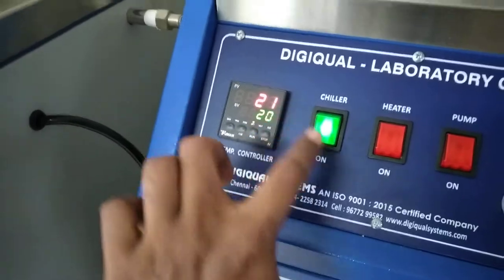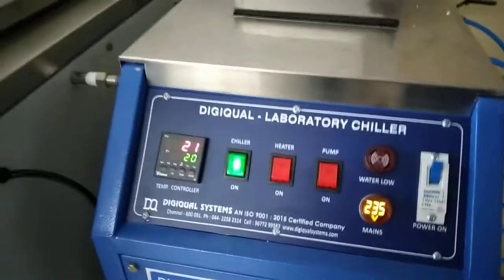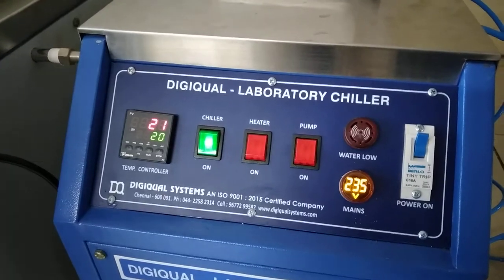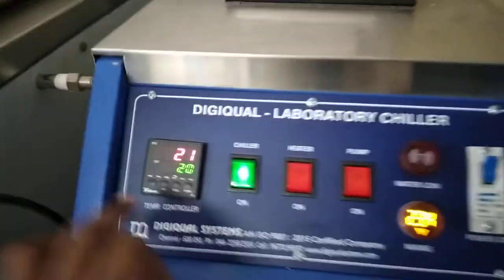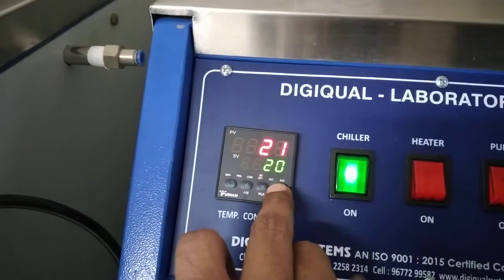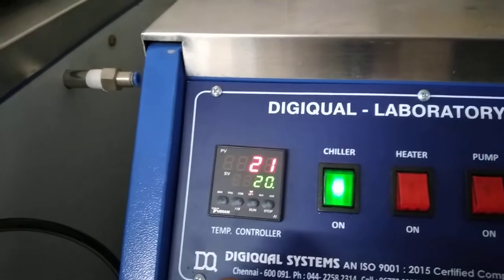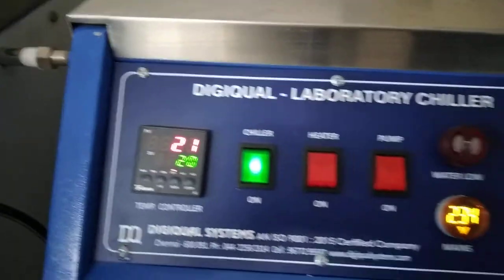Now the temperature has come to 21 and the compressor is on. The compressor has switched on — it will again give the cooling. The setting of the temperature controller is very simple. You can just increase or decrease the setting. It is very simple to make the setting.